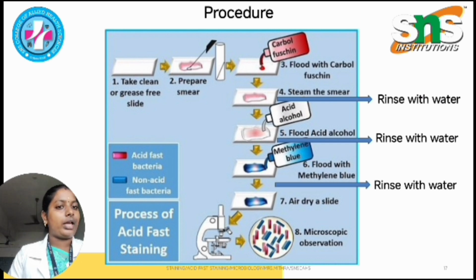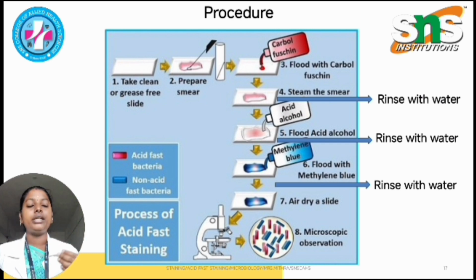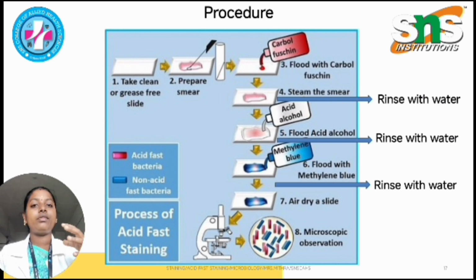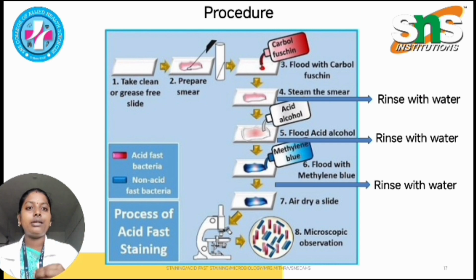After adding acid alcohol, wait for 1 minute, and again rinse it with water. And finally we add the counterstain. The counterstain is nothing but the methylene blue stain.